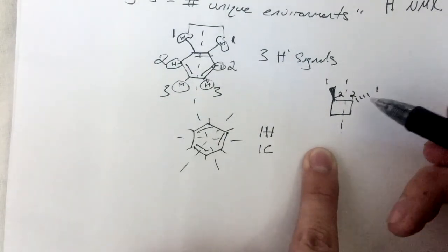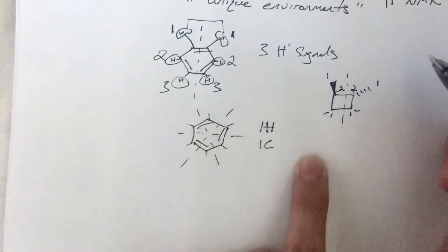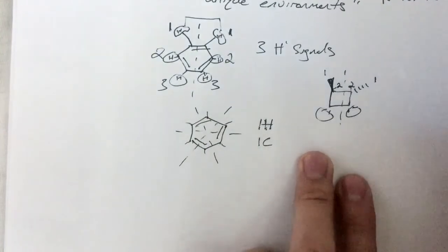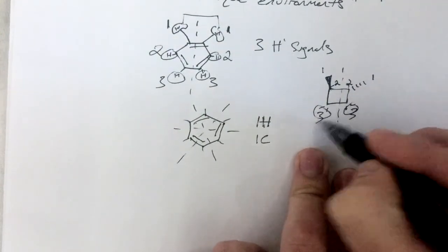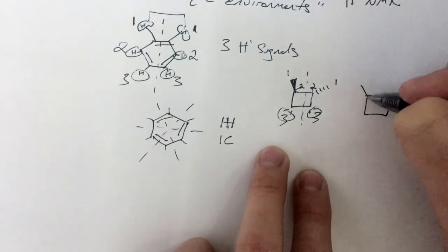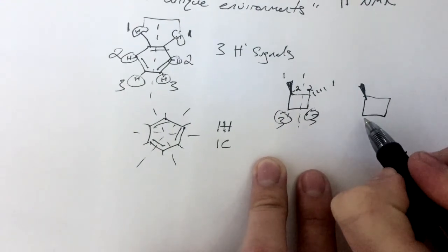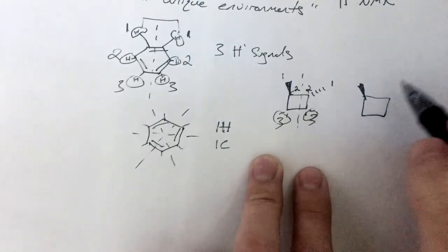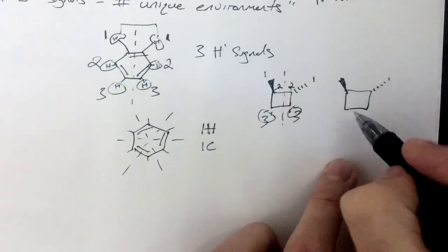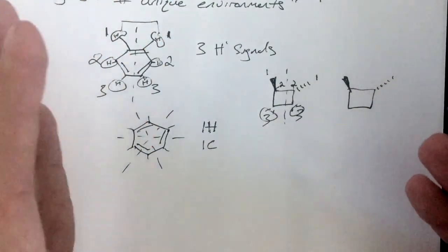And now these two hydrogens are where a lot of people get tripped up. A lot of people will say that these are in the same environment and will say 3, 3, when that's really not the case, because when we go back to the basics of orgo, this is an sp3 hybridized carbon, and so one of the hydrogens is going to be pointing in one direction, and one of them is going to be pointing another.